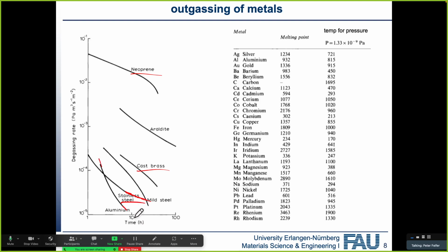The reason for that is that the aluminium itself has a very low hydrogen diffusion rate, and as such we don't get hydrogen diffusing out of the chamber, but it also has a slightly porous oxide. In the aluminium oxide, a lot of dirt typically hides, a lot of sorbed material. So initially you need to get rid of all the dirt that's in the oxide. Maybe you can, maybe you can't, but then it gets very good. And with stainless steel, eventually the hydrogen is going to be the last residual to go. Of course, baking is a little bit more limited with aluminium compared to stainless steel, but it's a different story.